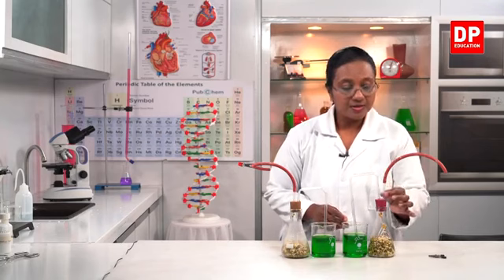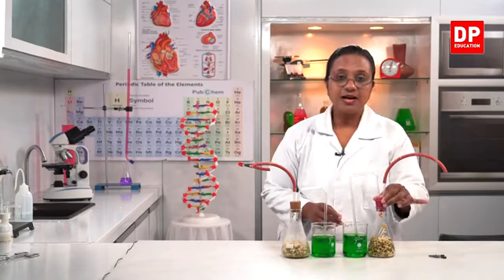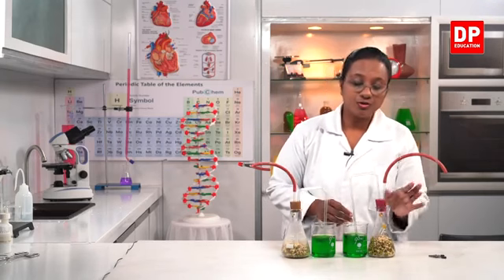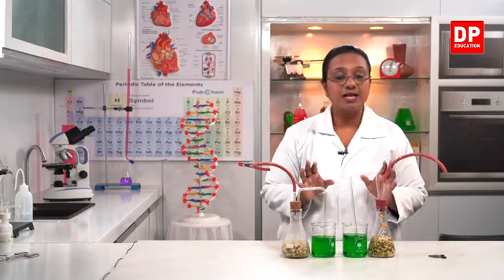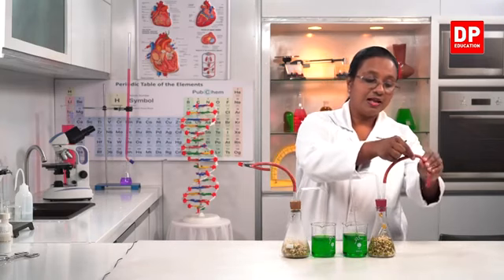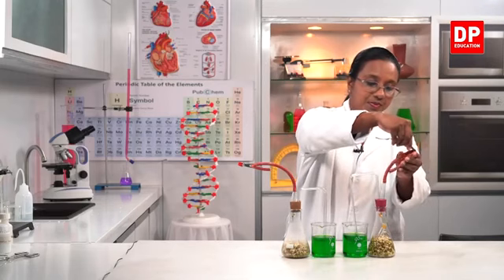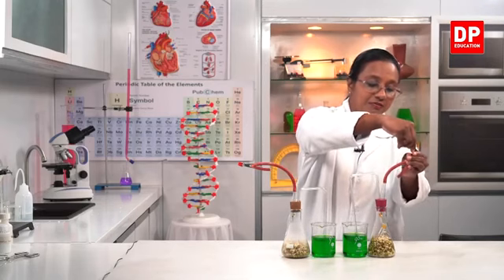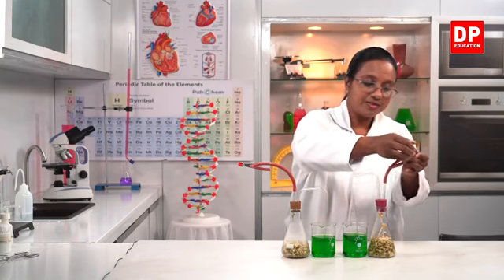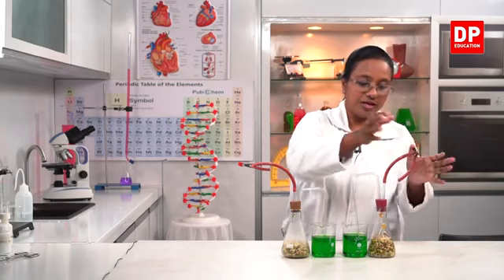The same purpose, the glass tube connected with rubber tube, so that when we fix it tightly here, air can flow out. So the pressure will be balanced inside both of the conical flasks. And after that, we will have to fold this and tighten it, so that when the setup is going to be observed, there is no air flow inside.